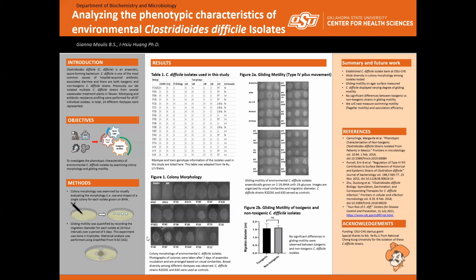Now, if you look at the bottom row, these colonies appear relatively smaller in size, while the colonies in the top row are larger, and they have these feather protrusions on the edges, which are indicating bacterial motility, which leads into the next part of this progress report.